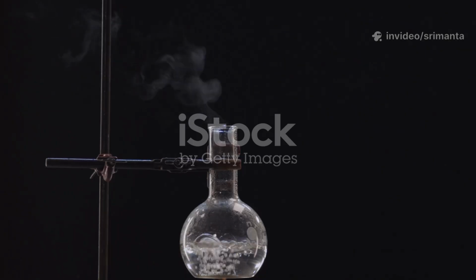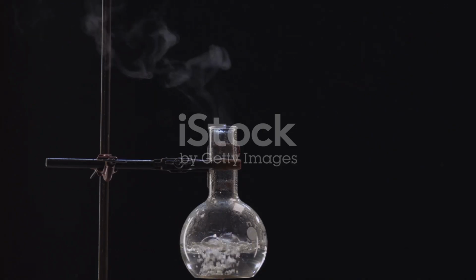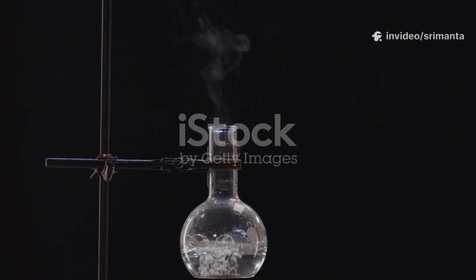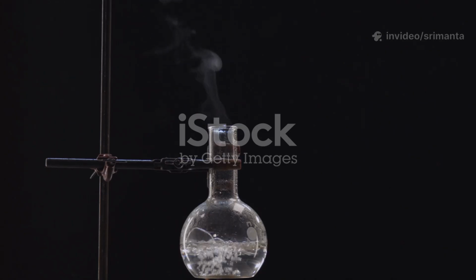The bottle needs to be big enough to hold all the liquids and allow for the bubbling reaction to occur without spilling over. Everything must be contained, so the gas we produce does not escape into the lab. Safety first, always. The bottle is the reaction chamber, the heart of our entire setup. Now let's look at the top part.